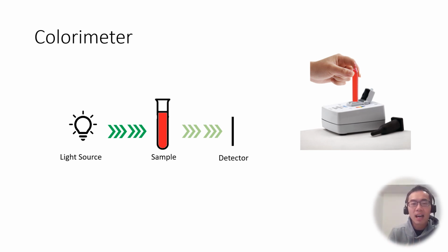So this way, we have a quantitative way of determining how intense the color is. It's no longer subjective and no longer depends on the person, right? It's the instrument that's doing the measurement. And more importantly, we can take this data and plot it on a graph. So earlier we talked about the y-axis being where we put the dependent variable. And in this case, the dependent variable, the thing that is being measured or observed, is the absorbance. And then on the x-axis, that is going to be the temperature in our beetroot experiment.